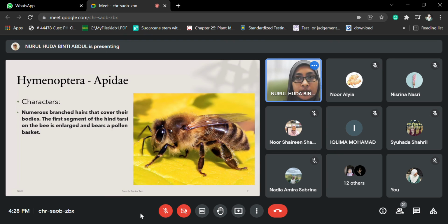Okay, so here for B, we can describe it as they have a mouthpart for chewing lapping. Maksudnya dua-dua. Okay, so where one part where they boleh chew pollen and other part of plant, and then there are also part yang membolehkan dia sedut honey. Okay, so it's actually more like a chewing lapping part. So dua-dua ada rather than just lapping.